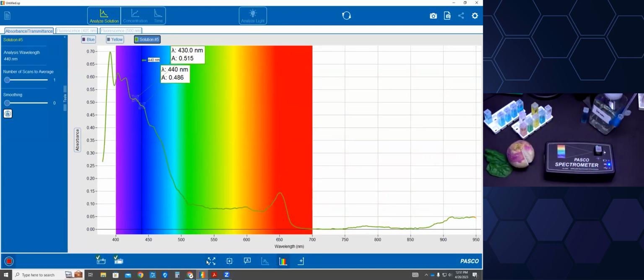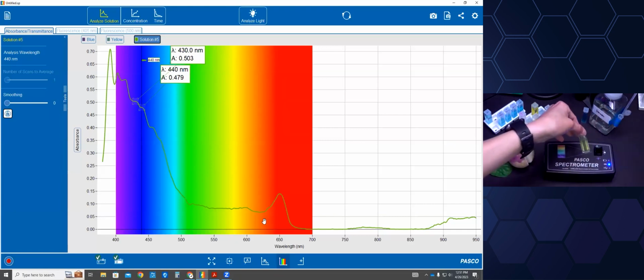And I'm going to scale. And okay, wow, look what I've got here. I've got this red orange and I've got this violet blue. Makes sense because my solution is green. But what also makes sense about this signature that you're seeing is these peaks are the peaks where the peak activity is of chlorophyll, of the chlorophyll pigment. So the solution that's green, it's chlorophyll among other pigments, but mostly chlorophyll.